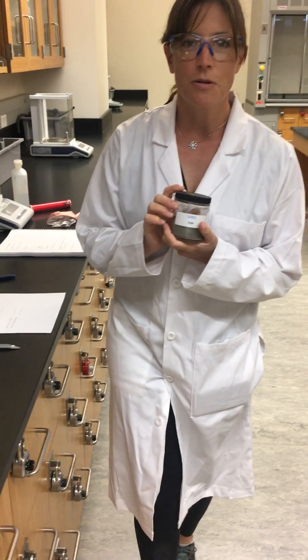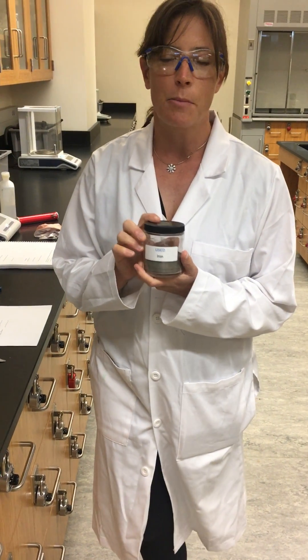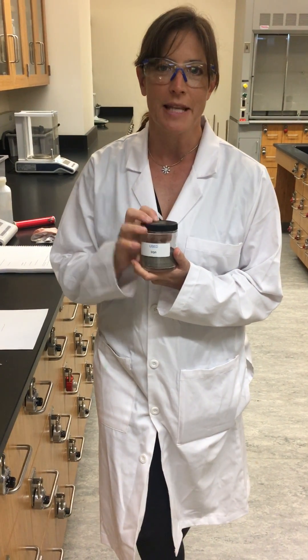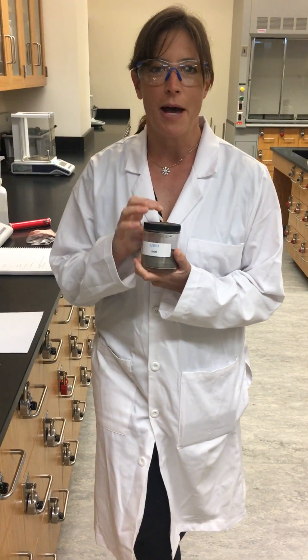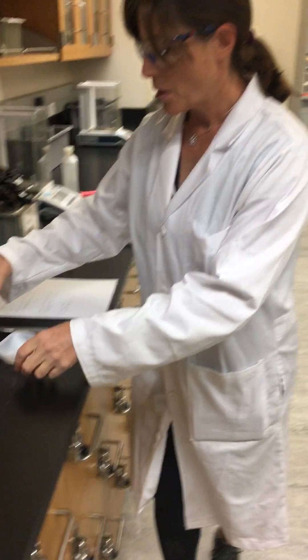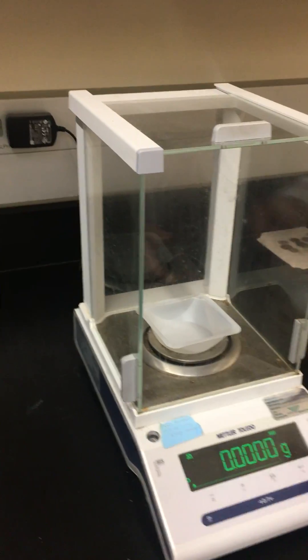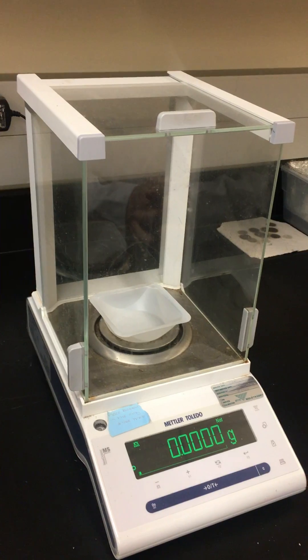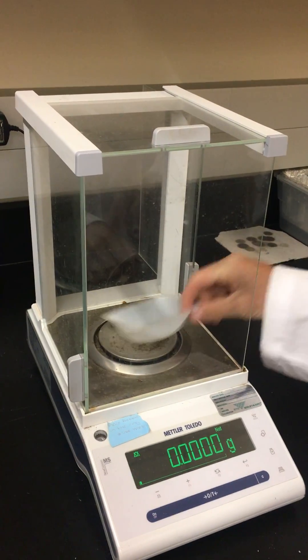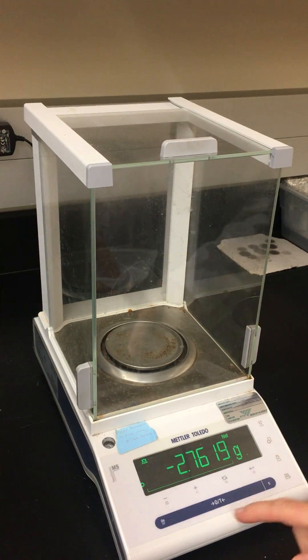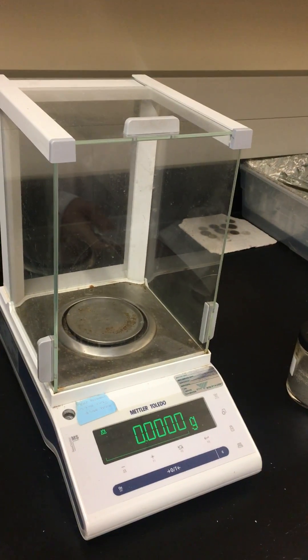So what we're going to do is we're going to try to calculate the number of iron atoms in a given sample of iron. So what we need to do is weigh a mass of iron. And so we're going to start by weighing the mass of our weigh boat. We always have to make sure our balance is zeroed first.